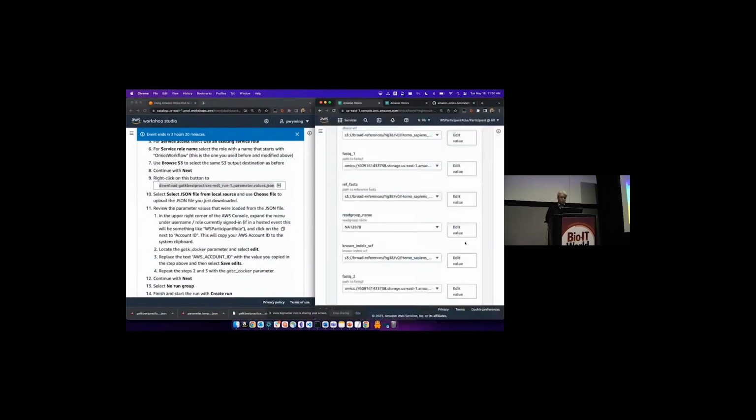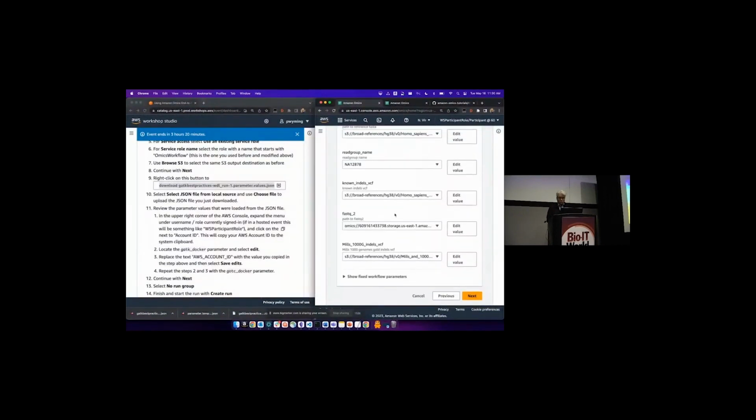We'll save those edits. Everyone with me? It should be source one, no underscore. So we click next and then go.